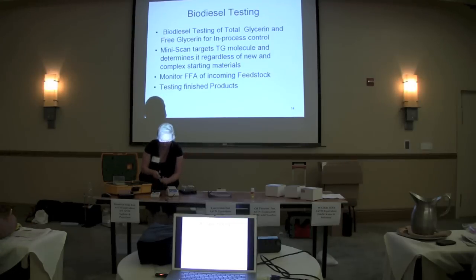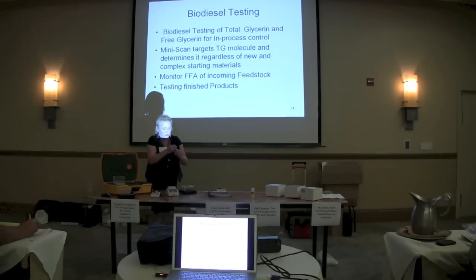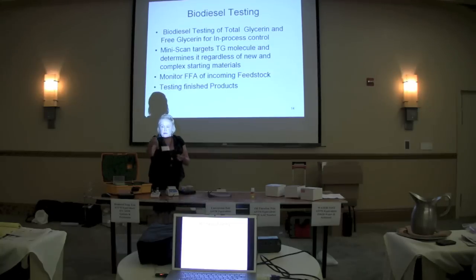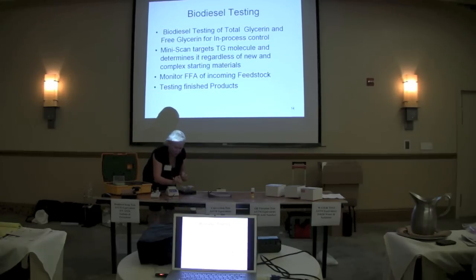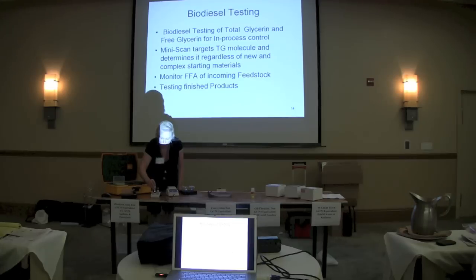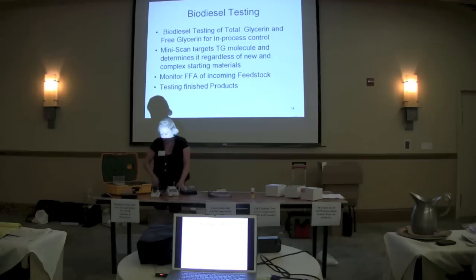These tips are not reusable. I'm going to take 200-microliter aliquots. This is the sample that I will test. You can see with that dilution, it really makes sure that we have very little interference. And I'm going to use a small 50-microliter pipetter to add some of that dilution to my tube with the enzymes. It starts a 10-minute countdown — we leave it in the heat block for 10 minutes.